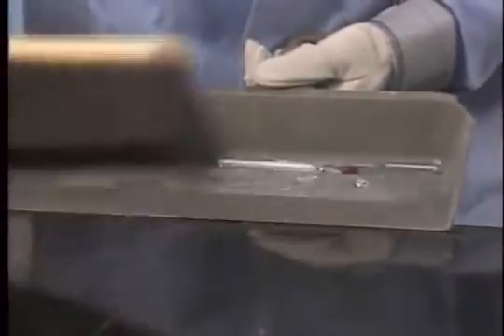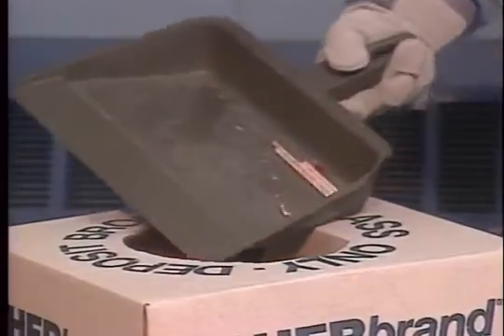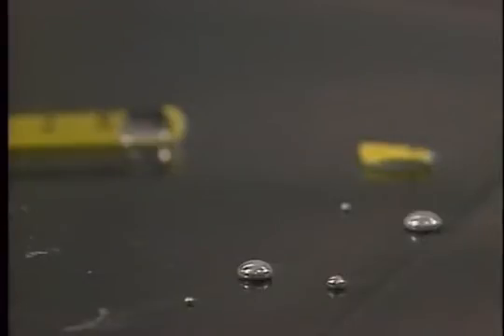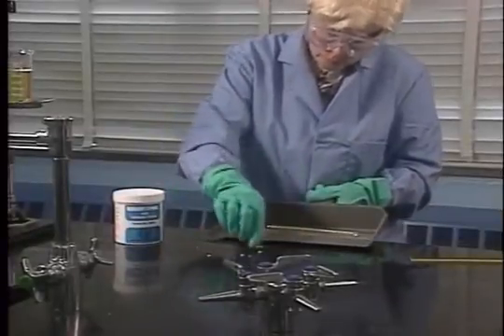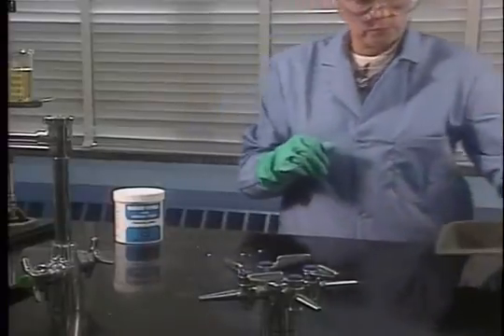Glass fragments can be swept up. If any alcohol happens to escape from the glass, it can be wiped up with a paper towel. Cleaning up a broken mercury thermometer is more difficult and also a job for your teacher. Mercury is poisonous, and it won't soak into a paper towel. Mercury vapors also can escape into the air.